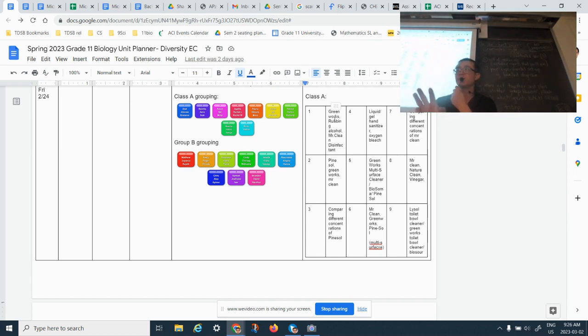Okay. Any questions? So that's the first part of what you are going to do. Record results, take pictures, and I'm going to be asking groups to come up and check the handwritten notes. Any questions? No? All right.